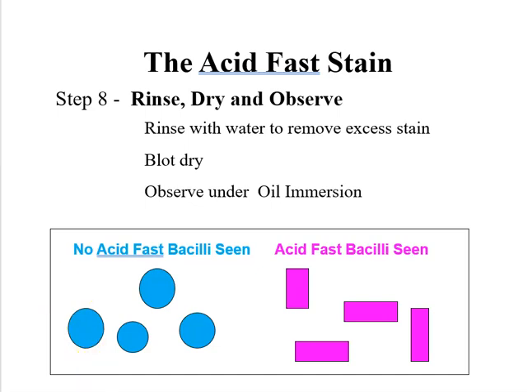Okay, so real quick, 5 minutes there in a lab. This would be the only stain we'd be doing for the day.